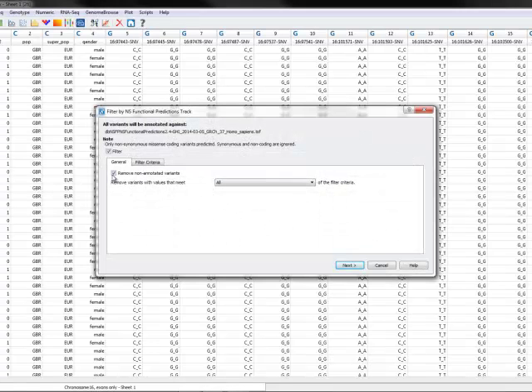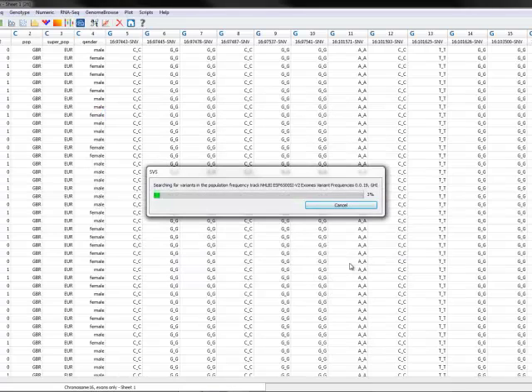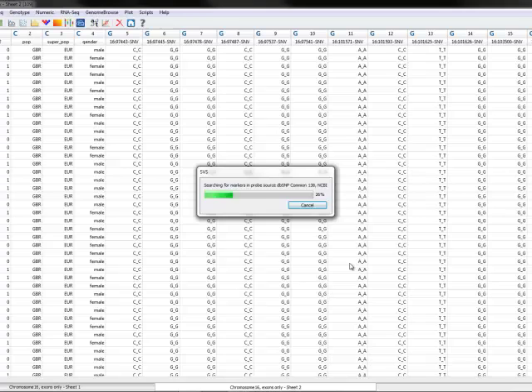And then finally, we'll keep the default filter on dbNSFP, which is going to remove anything that's synonymous. It will remove anything that is non-synonymous but uniformly predicted benign by all methods. So it will just leave us with things that show potential for being damaging in at least one method.